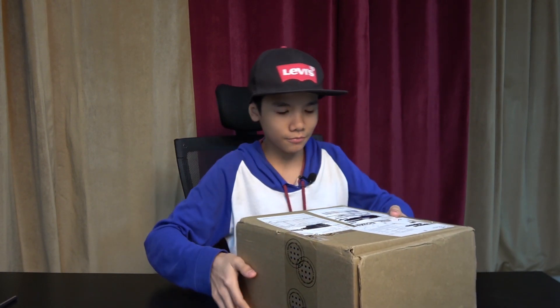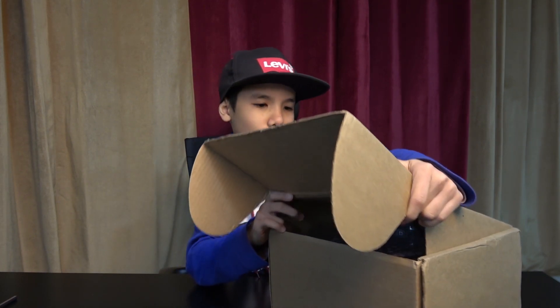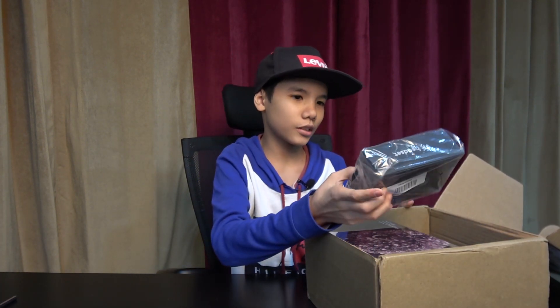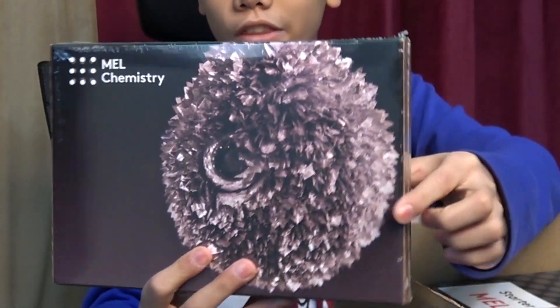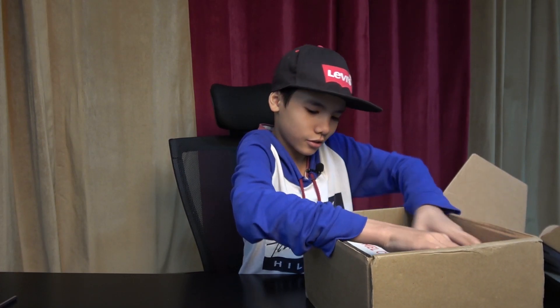Let's get straight into the unboxing! We already cut the tape off. There are multiple boxes inside. The first one is a VR cardboard, so I'll put that to the side. The next box is tin — it says tin here, pretty interesting spiky looking thing. And the next one is a big one.